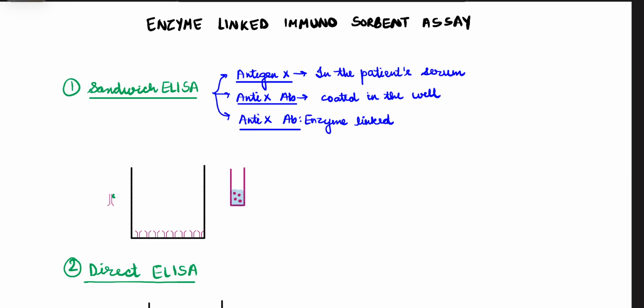So first of all we should know what the meaning of assay is. Assay is actually a kind of test which we are doing. It can be a confirmatory test, or a concentration based test, anything like quantitative or qualitative. So that is assay, and here we are doing the immunosorbent assay. So it is basically immunity related, we know this, and it is antigen antibody interaction.